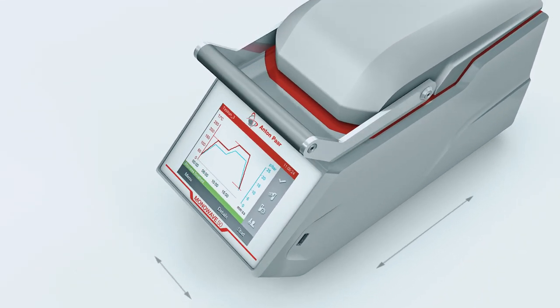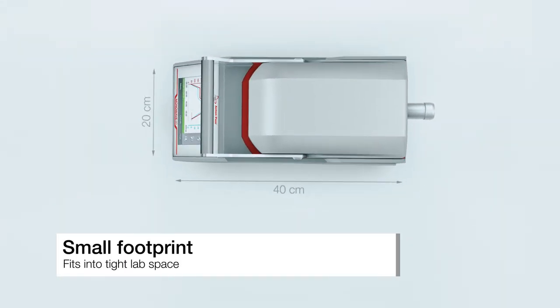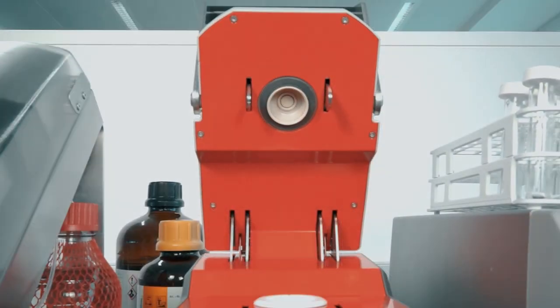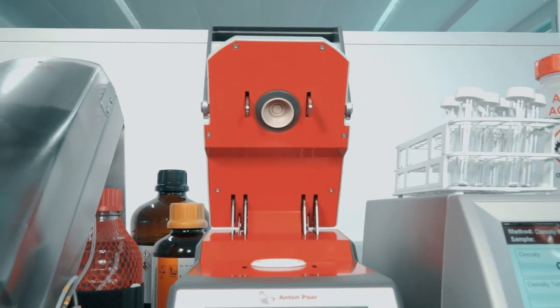With a footprint of only 20 by 40 centimeters, Monowave 50 takes up minimum lab space. With these dimensions, it even fits into the busiest lab and is ready to simplify your work.